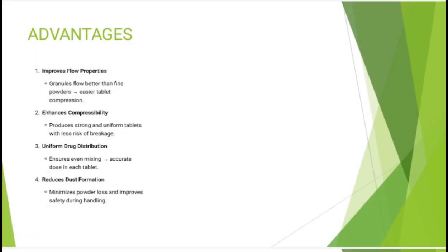Then we will see about advantages and disadvantages of wet granulation method. Advantages: improves flow properties. Granules flow better than fine powders. Easier tablet compression. It is easy for tablet compression.